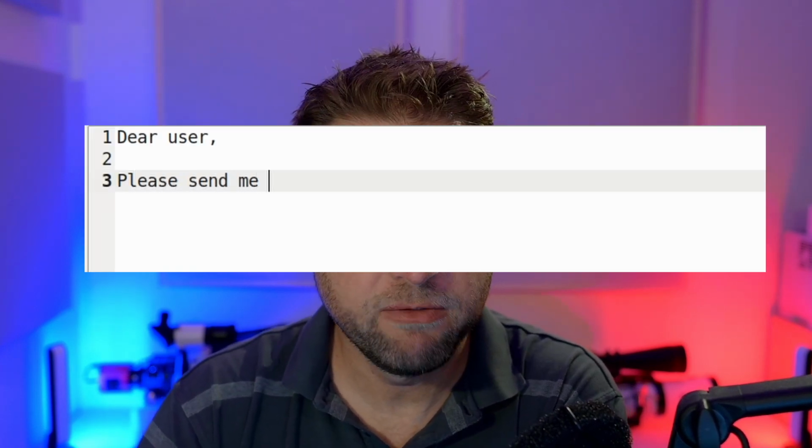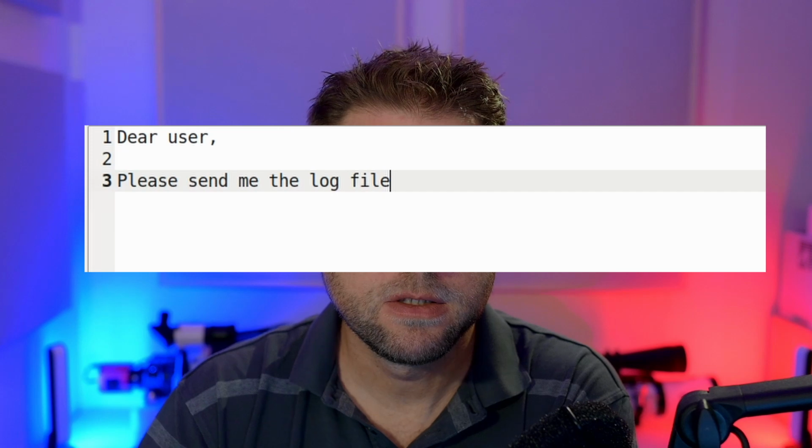I'm getting a lot of emails from Profex users asking for support, for example because the installation doesn't work or they have problems creating instruments configuration and so on. And I don't mind at all. I'm actually enjoying being in contact with the community. However, I also noticed that I always have to send the same requests to ask the same information from them. So I thought I will record this video and show you how to properly ask for support.